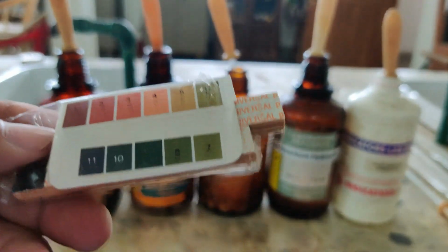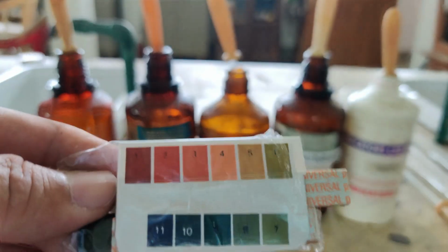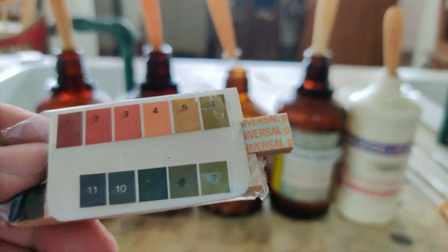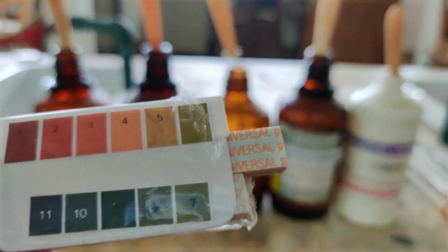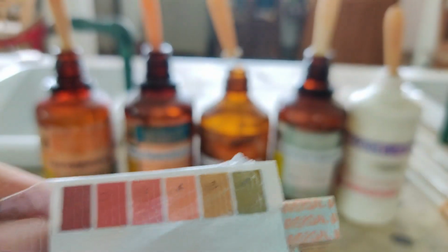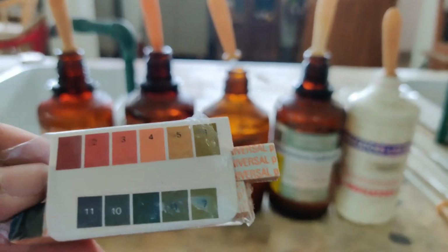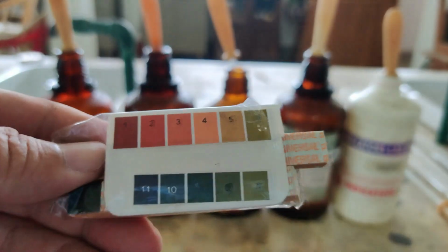We have to compare the color change with this one, so that immediately you can identify which color the paper has changed to, and then you can identify the pH value. If less than 7, you know definitely it is acidic. A common indicator can tell you only whether it is acid or base. But universal indicator will tell you how acidic, because the lower the number, the more acidic it is, and the higher the number, the more basic it is.